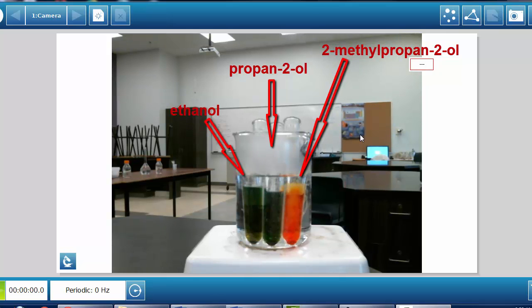All right, now the extent of the reaction will change depending on whether it's refluxed or not. So reflux means basically to boil and recondense. All right, so as you can see, my primary and secondary alcohols have reacted, but my tertiary alcohol, I still have that dark orange color of the dichromate ion. So to me, that's the indication that no reaction has occurred there.